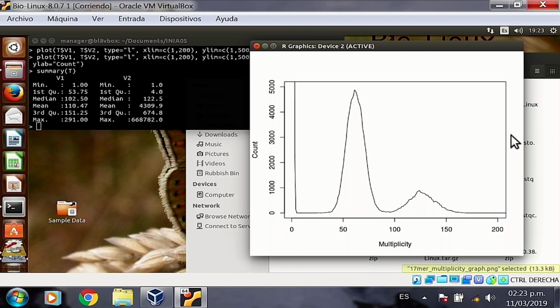Then here, we go all the way here. It would be around 57, something like that. There were nearly 5,000 different Kmers that were counted around 57 times. This is basically telling us that most of my Kmers that are not errors are being counted in this area.